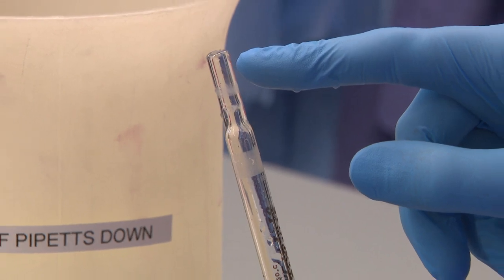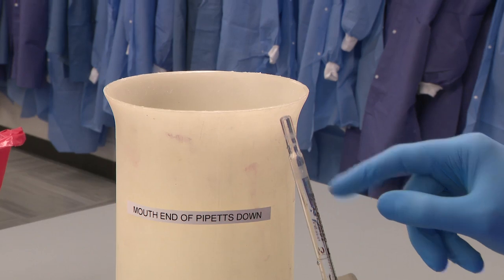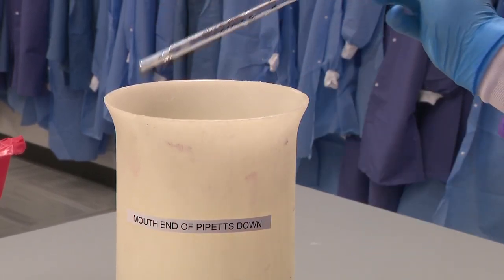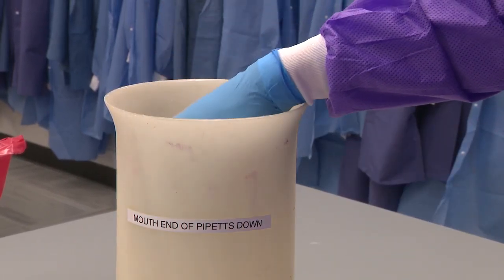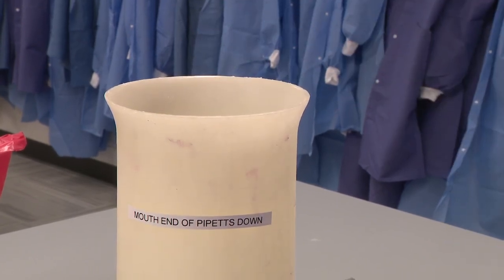If it is a single-use pipette, we will dispose of it in the sharps container. Some laboratories supply reusable glass serologic pipettes. In this instance, the laboratory would have a pipette washing, disinfecting station, so you would place your pipette in the container with the rest of the pipettes that need to be cleaned.